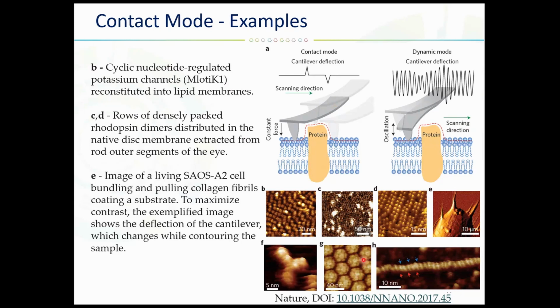This picture is viruses that are packed in a crystalline assembly. And on H, you can see a part of a plasmid DNA. So again, what I want to repeat is that the higher resolution can be achieved, but usually it is done in a dynamic mode because these molecules are quite fragile.